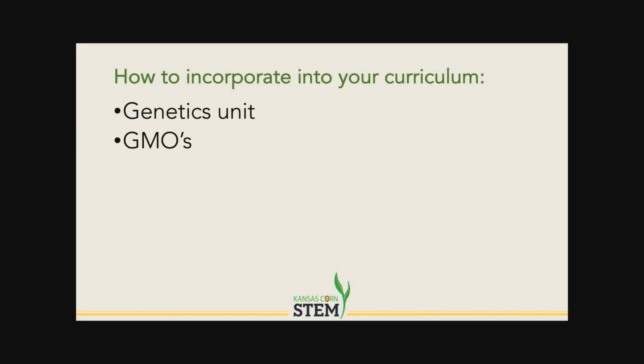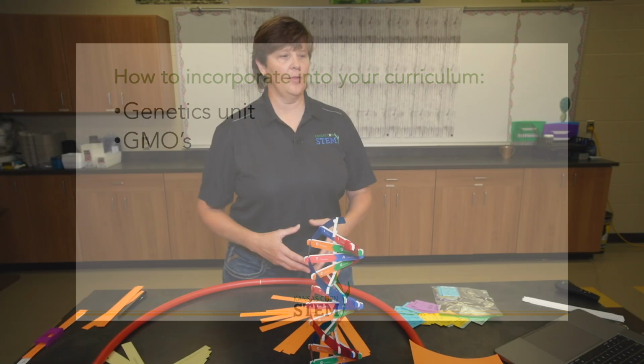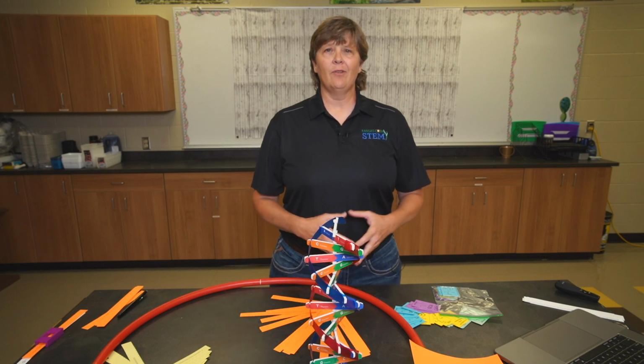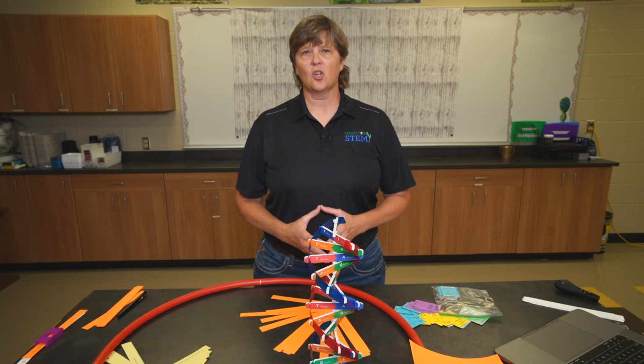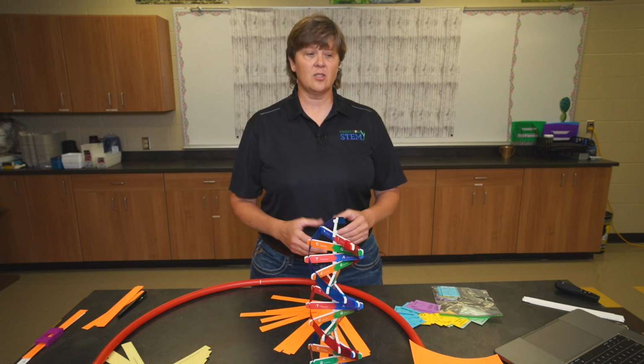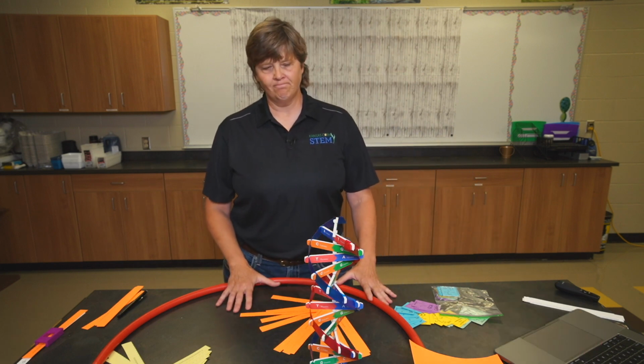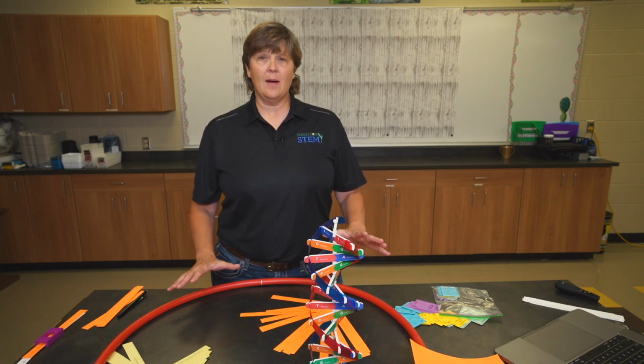This unit can be incorporated into every biology class, whether we're in high school or middle school. Certainly with all of the genetics information that students are exposed to in the media today, they have a growing interest in everything related to DNA, from their own ancestry account or 23andMe, to everything that they're hearing about GMOs. There's a great deal of interest in genetics for our students, and so this is a perfect activity for them to participate in. This is a very simple lab to set up.